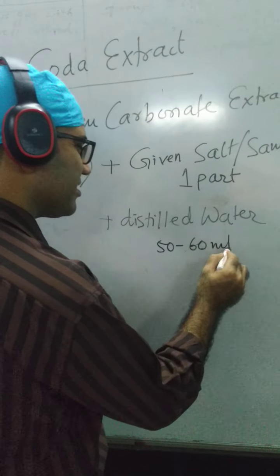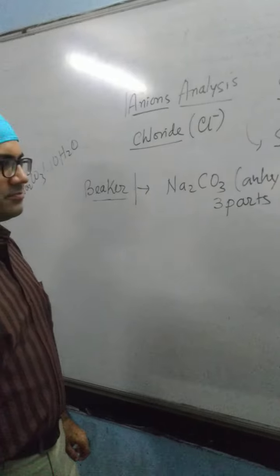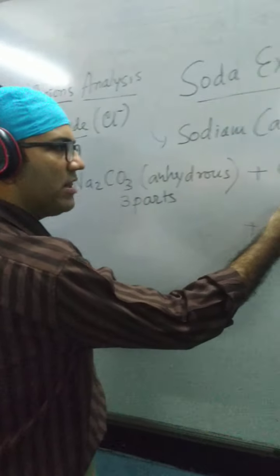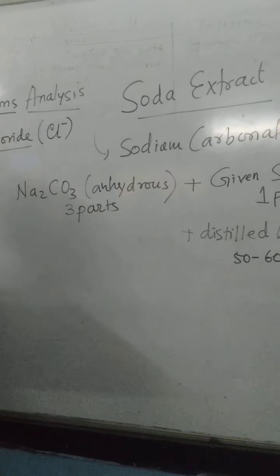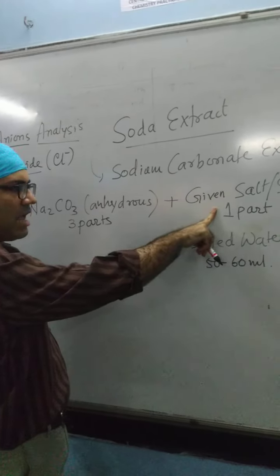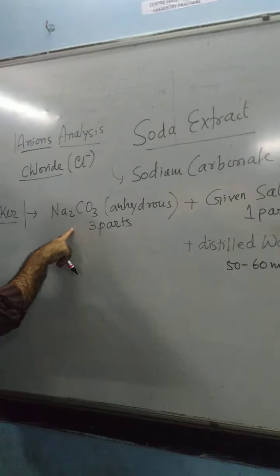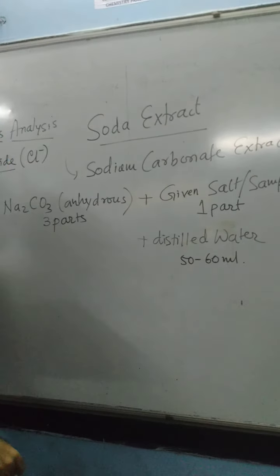That's enough; more than that is unnecessary wastage of water. So that means a 3:1 ratio, and the 3 parts has to be sodium carbonate.